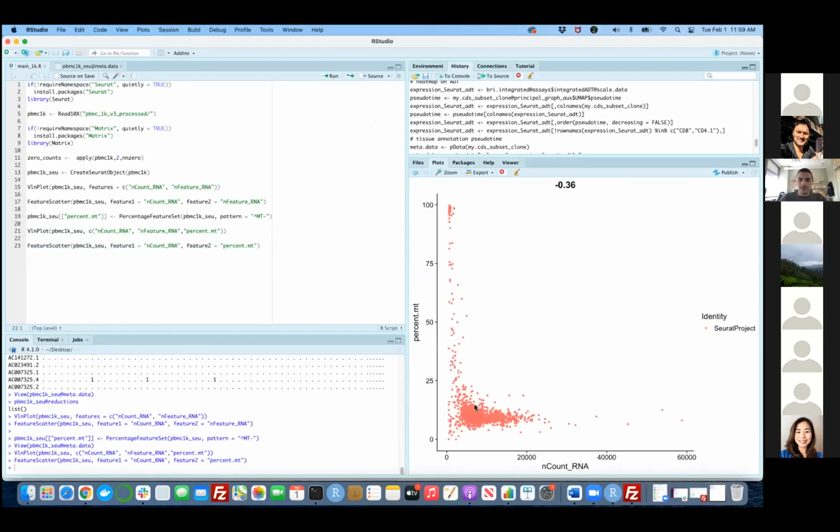Okay, as you can see, some number of cells have a considerable number of UMIs, but as the percentage of mitochondrial content increases, their UMIs are quite low, meaning they have nothing other than mtDNA to contribute to the expression profile of a cell. So they probably need to be removed. Taking a quick look at this chart, you can see that maybe, just maybe, somewhere around 20% is a good threshold, and you can implement this threshold to subset your Seurat object.